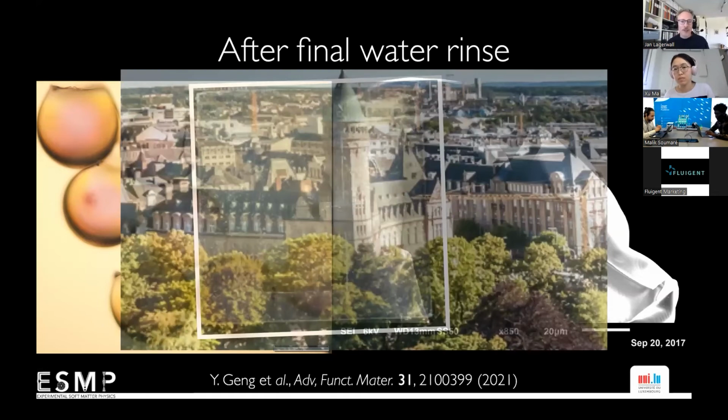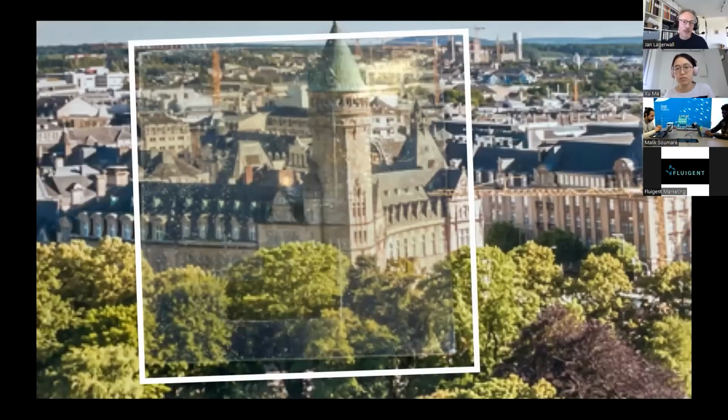And that's the reason why we can make these markers so invisible to the human eye, because we have this one hole in every shell, and we can fill with an index matching binder as well as surround by an index matching binder, and we can get rid of all the stabilizer residues.